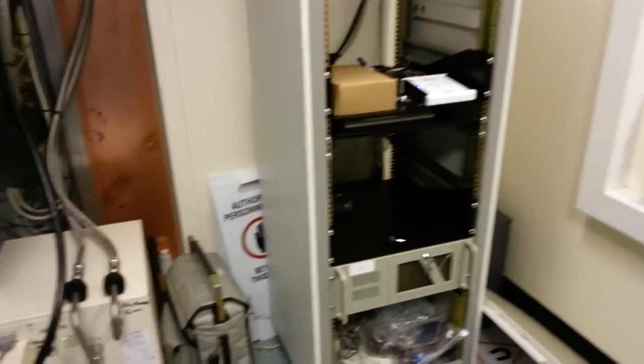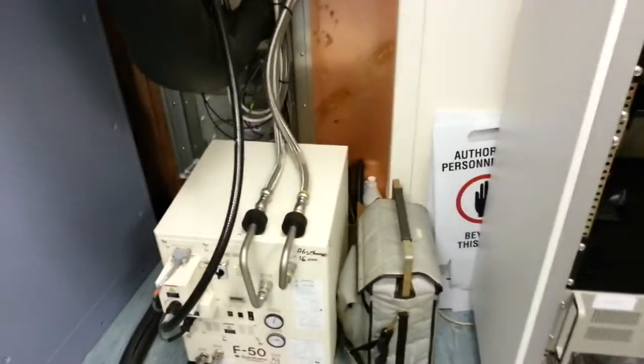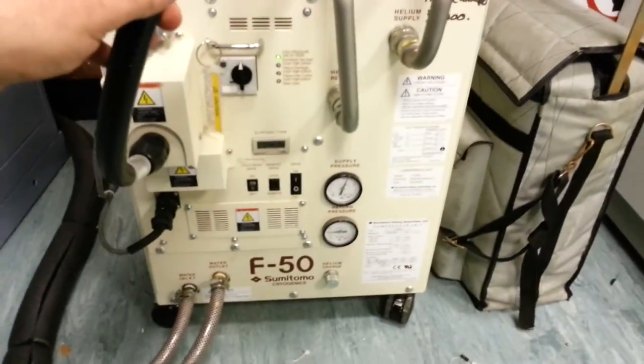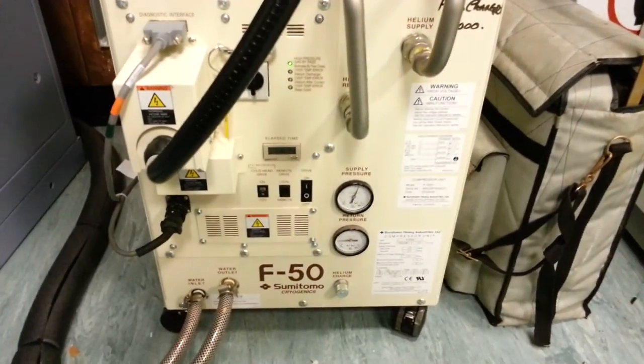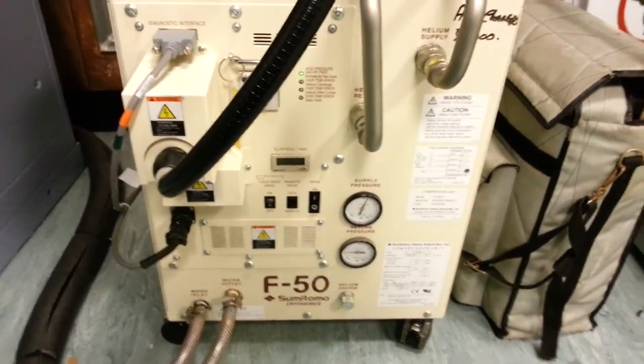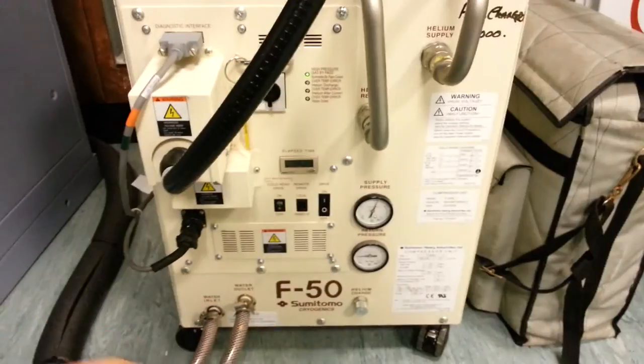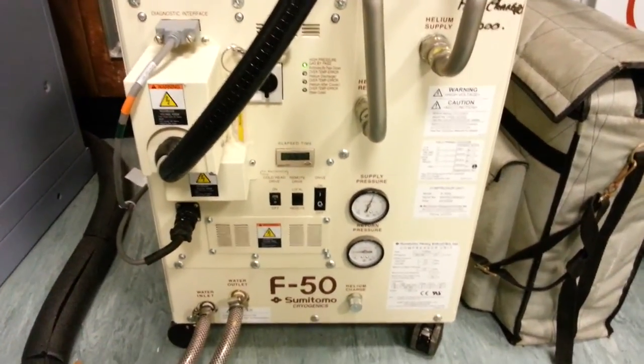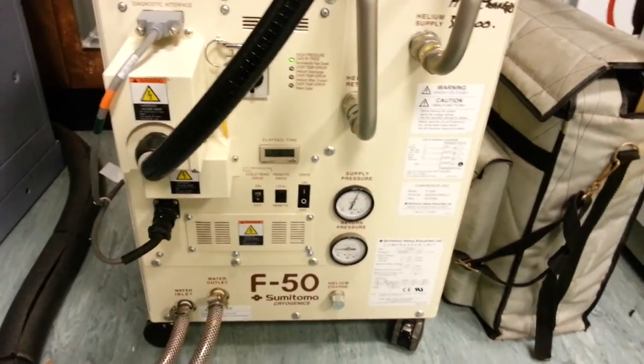I'm sorry about the noise but there's a lot of equipment in here. We're looking at this — this here is a helium compressor which is part of a Gifford-McMahon refrigerator. It's a fairly standard scroll compressor, about 10 or 12 horsepower I think.